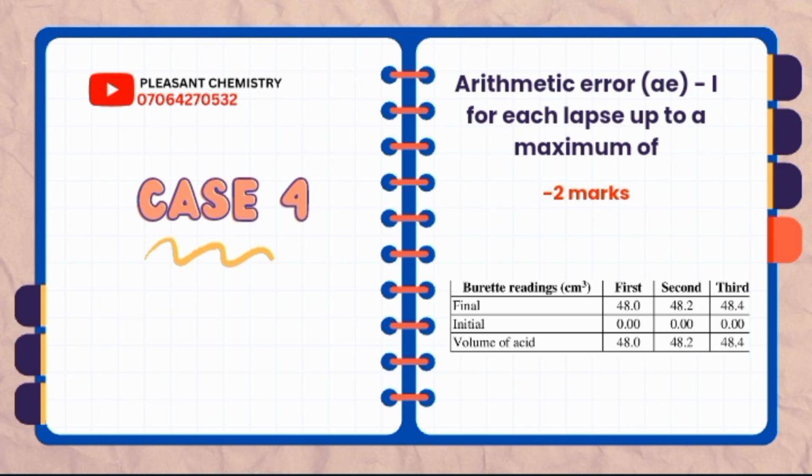But the table I'm showing here has one error, and the error is that the burette reading is in 1 decimal place, which is supposed to be in 2 decimal places. So when you are drawing your table, make sure it is in 2 decimal places, and also ensure that you subtract the initial burette reading from the final burette reading in order to get the volume of acid used.